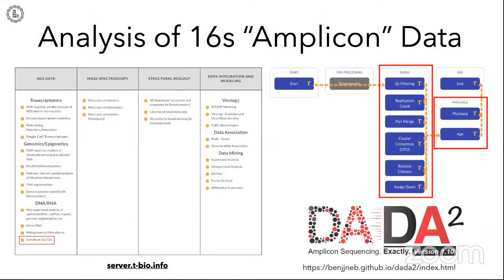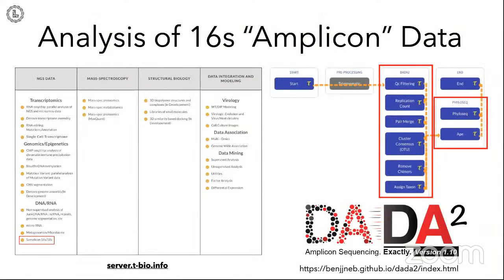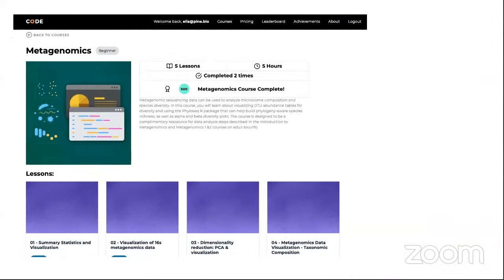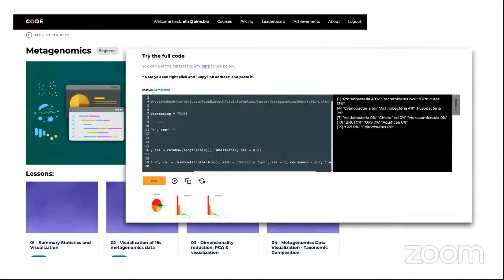Okay, so we had here a brief overview of the data pipeline, and we understood how sequencing data is processed to create an output. And then we looked at some examples of code in R that allow us to study in detail some of the variation to understand what it might mean and start thinking about the biological implication.